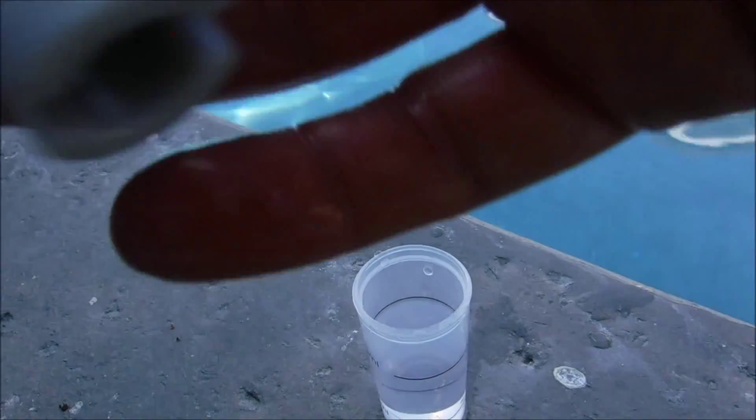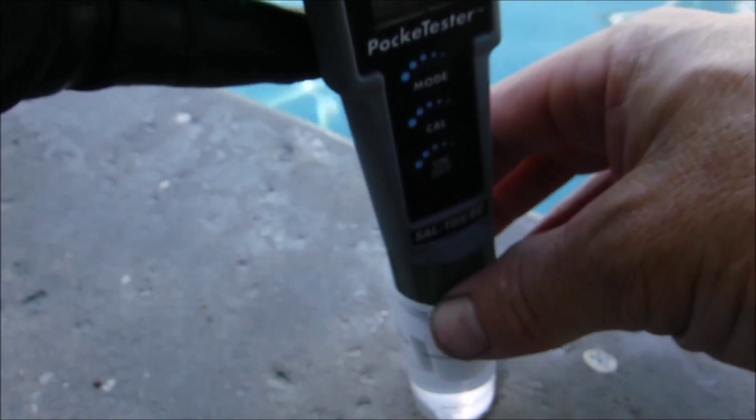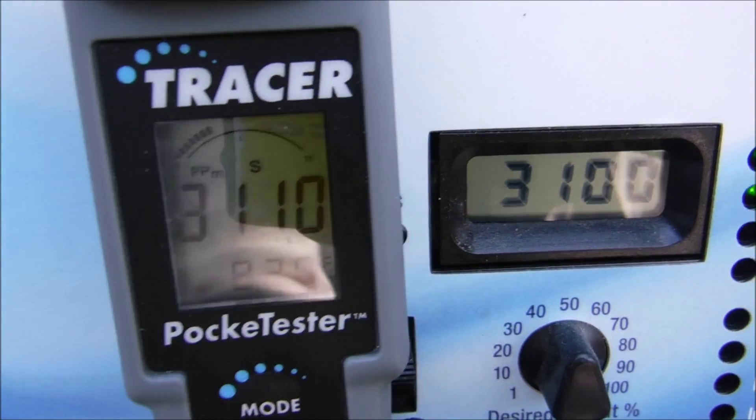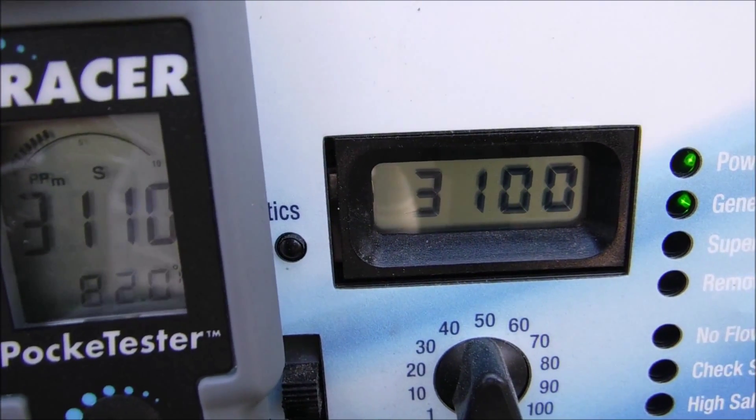In this particular pool I'm going to go ahead and test the salinity. Make sure you're in salinity mode and dip the tip of it into the sample. The Tracer is reading 3,100 ppm, and the Aquarite system is also reading 3,100 ppm.